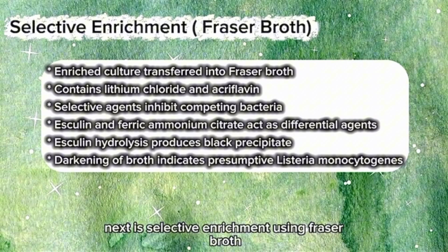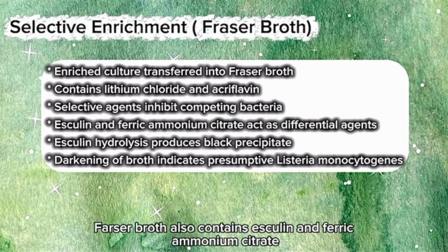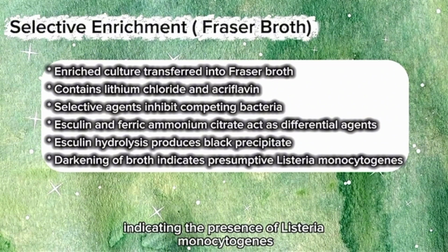Next is selective enrichment using Fraser broth. This medium contains selective agents such as lithium chloride and acriflavine that inhibit competing bacteria. Fraser broth also contains esculin and ferric ammonium citrate. When Listeria hydrolyzes esculin, blackening occurs in the medium, indicating the presumptive presence of Listeria monocytogenes.